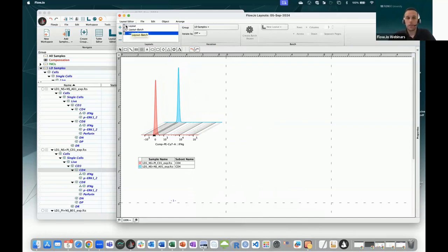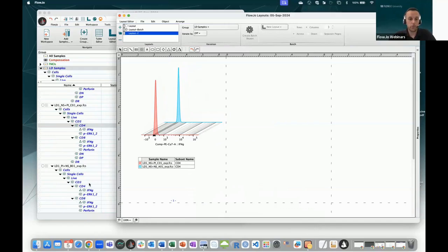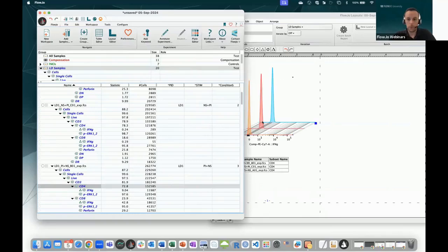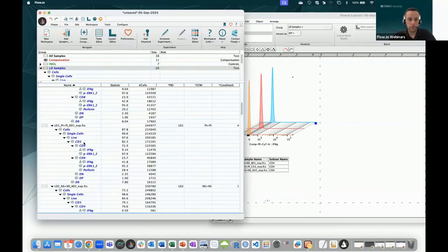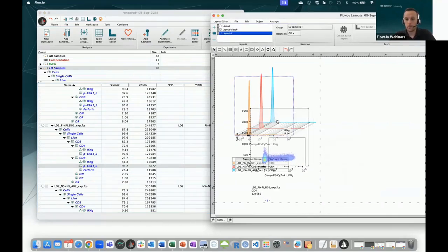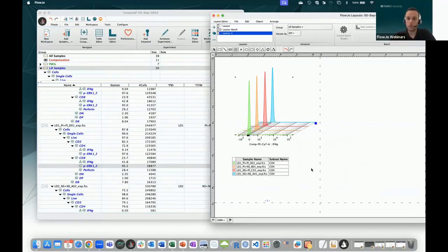All right, so let's go. Let's put the 4 conditions. Sorry, we're still at 3. So we have two conditions, third condition, and fourth condition. And let's pretend I missed it. I didn't put it on top. Don't worry. When you go back, you see the square becoming blue. I can add it anytime. And I have my 4 conditions. I can change the order I want.